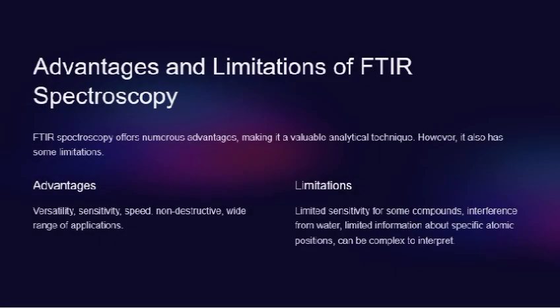Now we'll discuss its advantages and limitations. FTIR spectroscopy offers numerous advantages, making it a valuable analytical technique. However, it also has some limitations. Some of its advantages include versatility, sensitivity, speed, non-destructive nature, and wide range of applications.